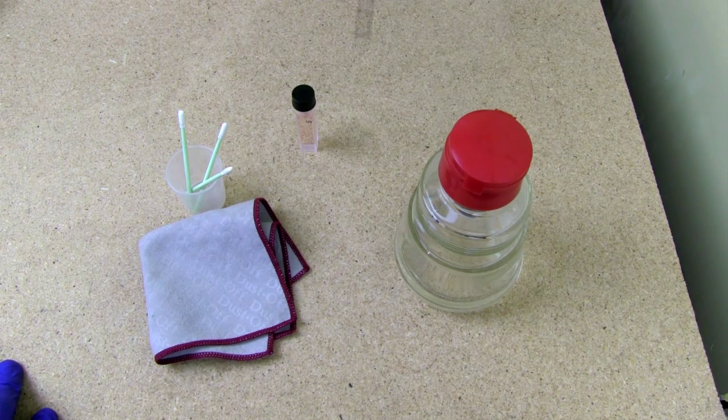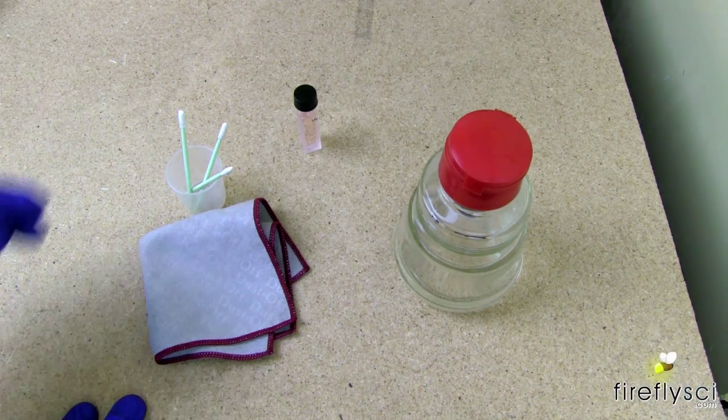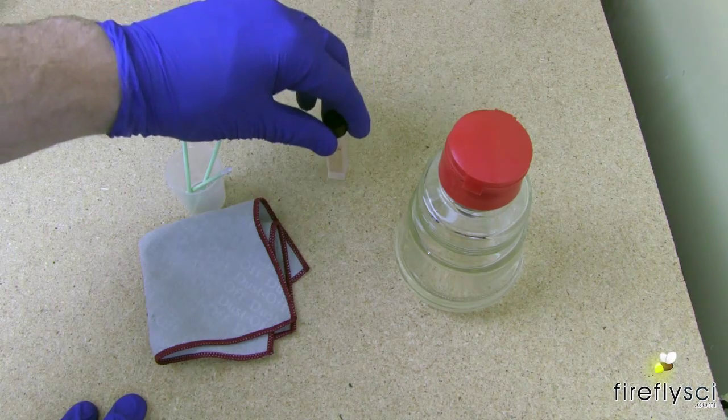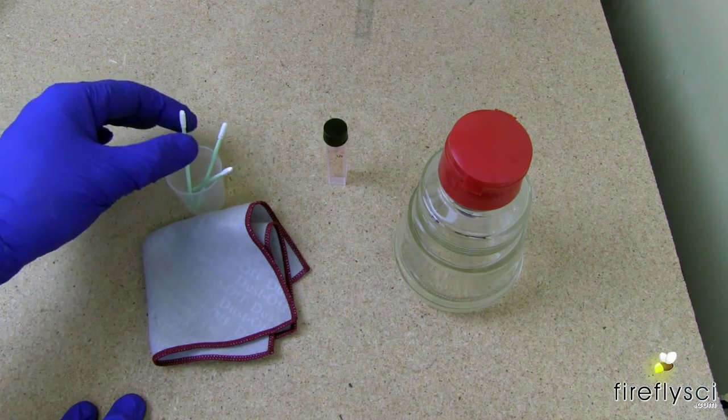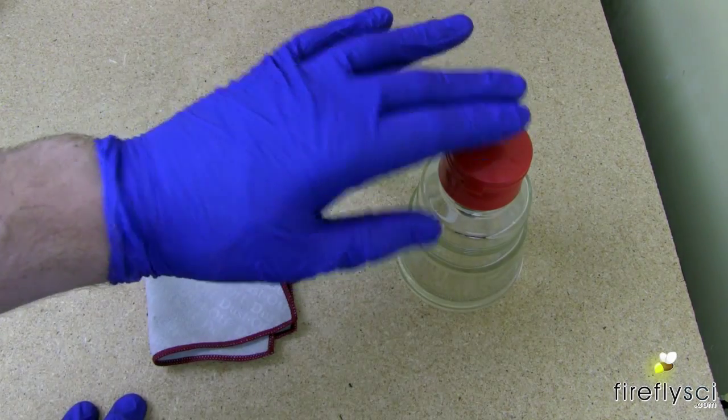Let's start with cleaning liquid calibration filters. I have a few things laid out here for cleaning this holmium oxide filter. Here we have our dust-free cleaning cloth and our cleaning swabs, and over here we have some alcohol.